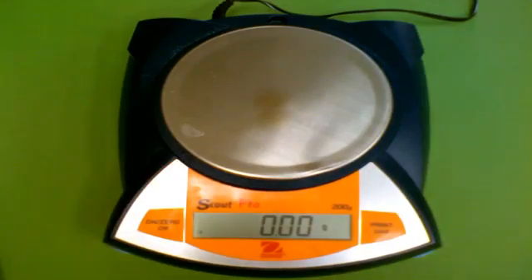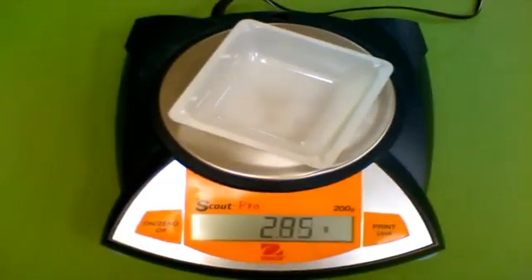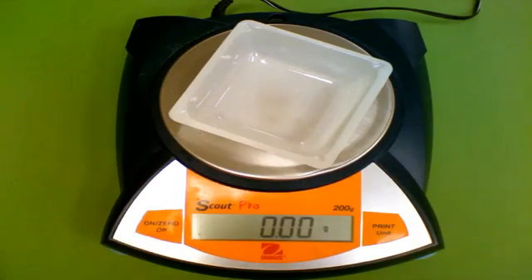To take the mass of any chemical, first place a weighing boat on the balance. You'll notice that the mass increases, so in order to zero that out, press the zero button again. Now you can start with a zero value.